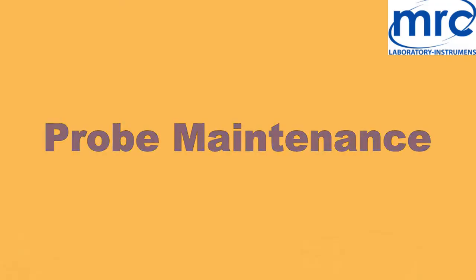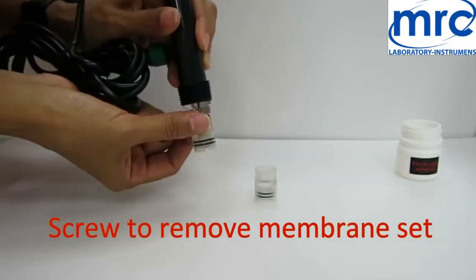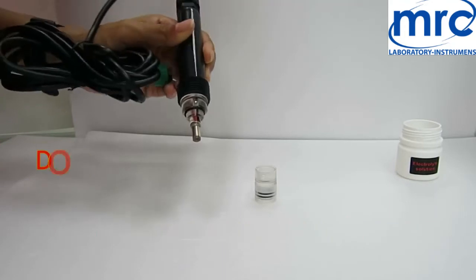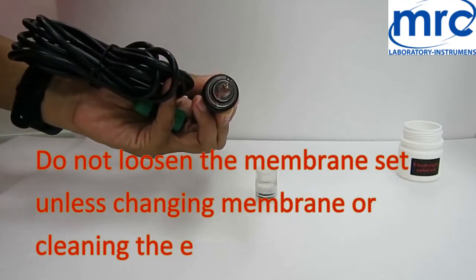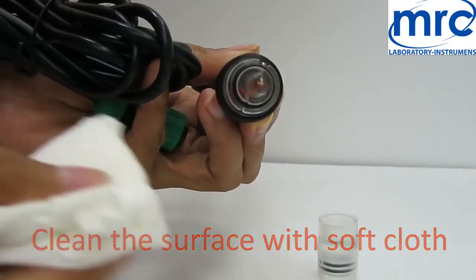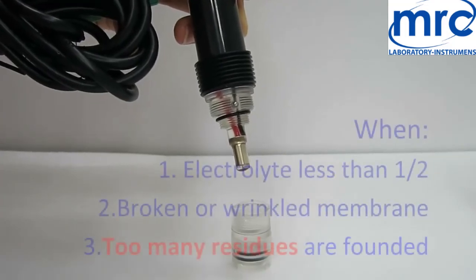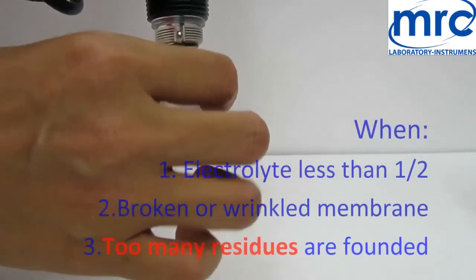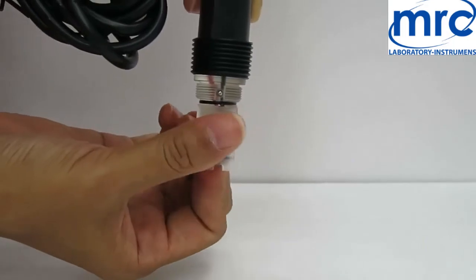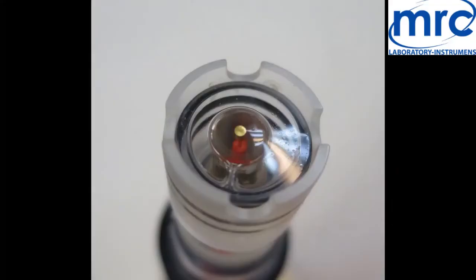Probe maintenance: pour electrolyte solution into the new membrane set until full. Remove the membrane set from the probe. Once the membrane set has been removed, do not reuse the same membrane set. Do not loosen the membrane set unless you need to change it or clean the electrode. Use a soft or long-fiber cloth to clean the surface. If residues cannot be removed by cloth, you can use a fingernail or knife to scrape. Only when dissolved oxygen electrolyte is less than half, the membrane is broken or wrinkled, or too many residues are found on the electrode working area, must you change to a new membrane set. Install the new membrane set with full electrolyte and screw it tight, then rinse with clean water and wipe.